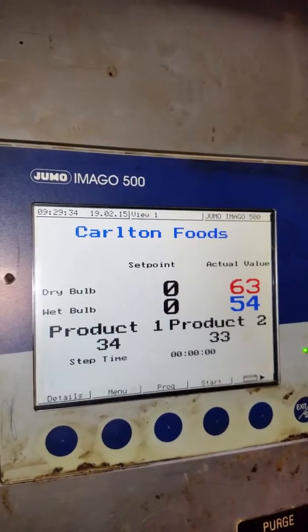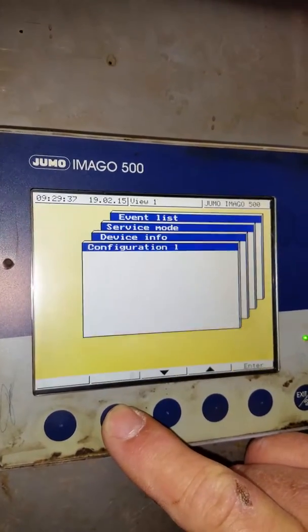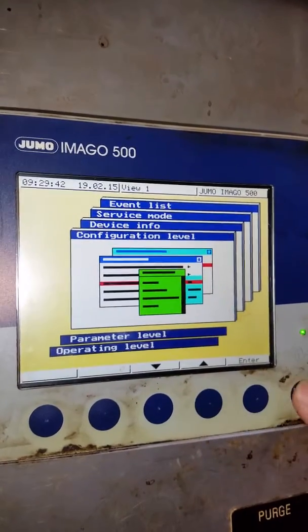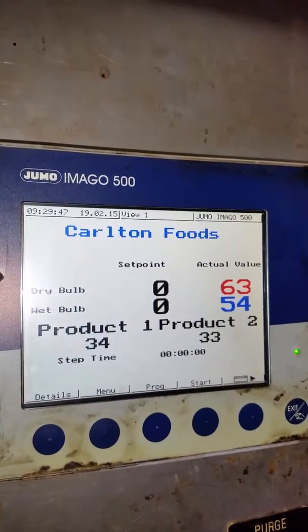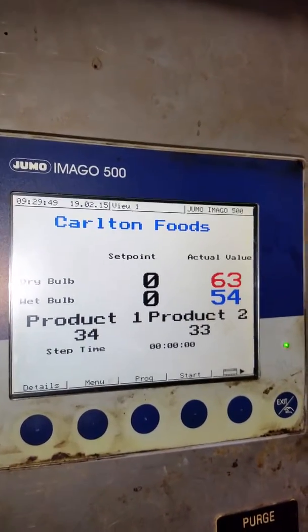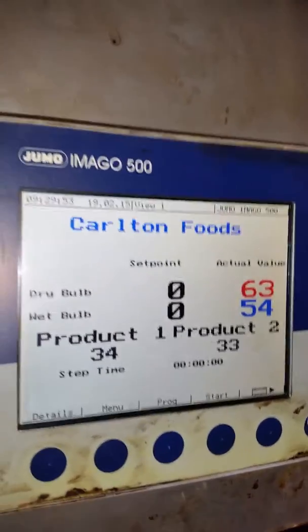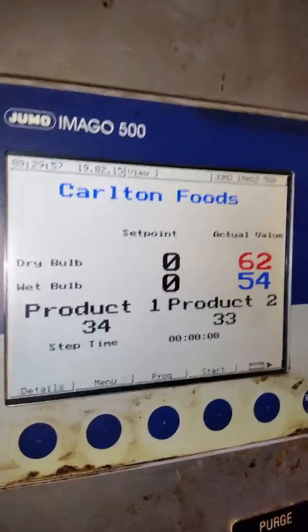Now to calibrate, go to Menu. But before we do that, we need to know what the probes are reading. Number one is reading 34 — it should be reading 32. Number two is reading 33 — should be reading 32.